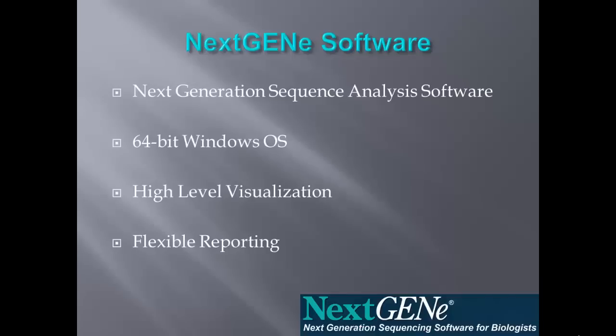NextGene is for the analysis of next-generation sequencing data. It runs on a 64-bit Windows operating system, provides high-level visualization of results, as well as flexible reporting options.